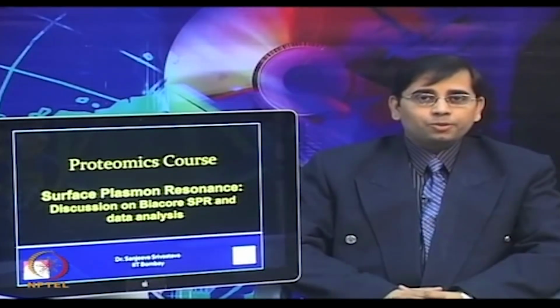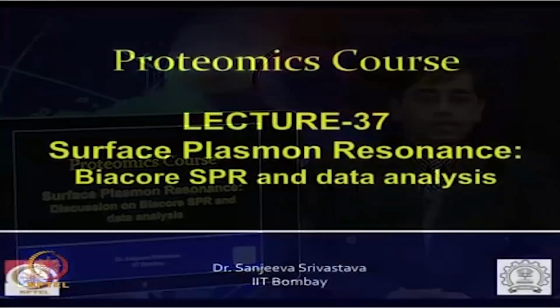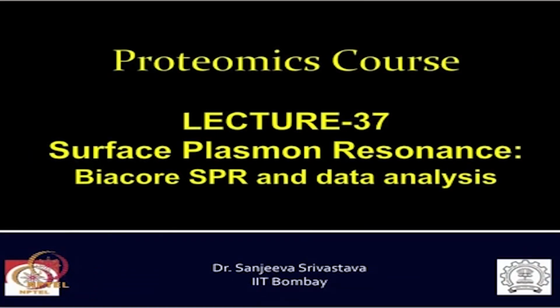Welcome to the Proteomics course. Today we will talk about surface plasmon resonance. We will have a discussion on Biacore SPR technique and data analysis.